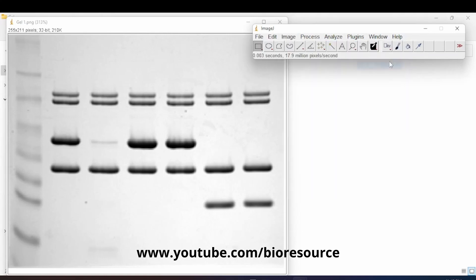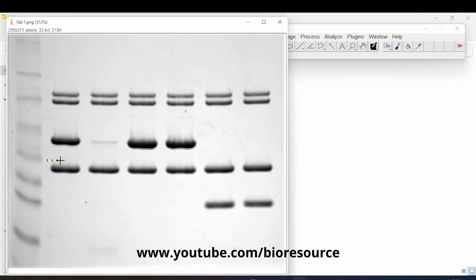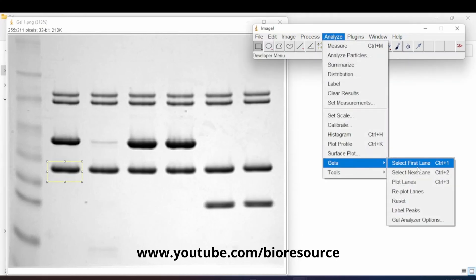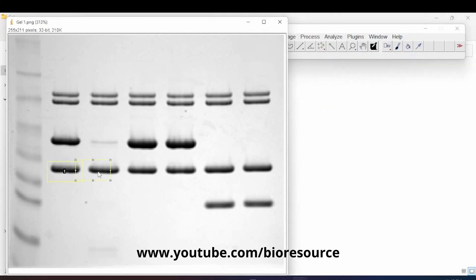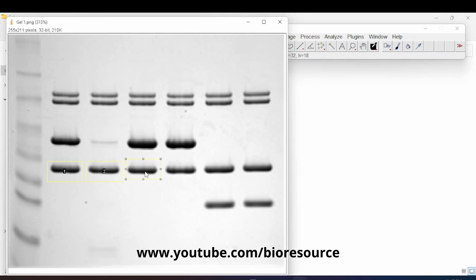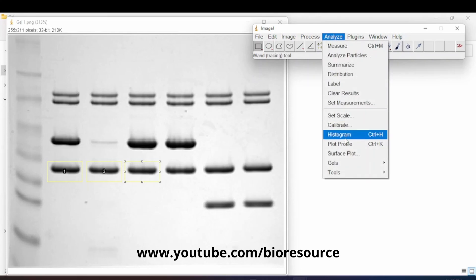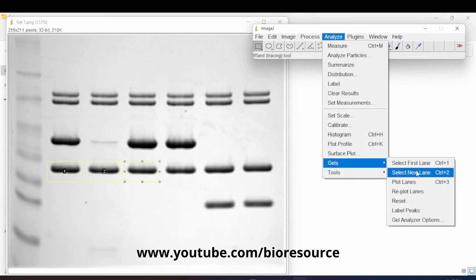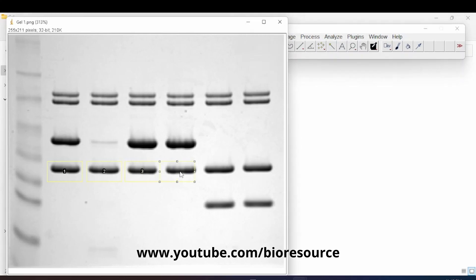Now use the rectangular tool to select the band you wish to analyze. Then go to Analyze Gels and select 'First Lane'. Move the rectangle to the next band, go to Analyze Gels, and select 'Next Lane'. Repeat this process for each subsequent band.